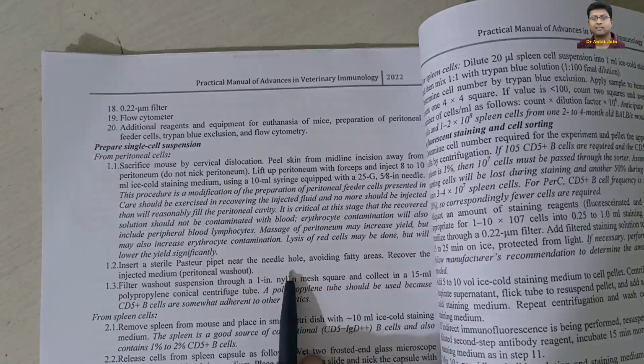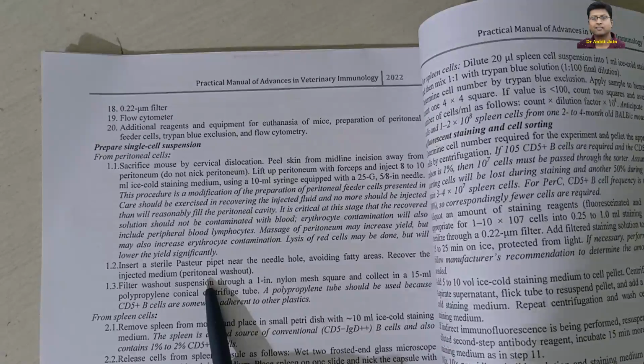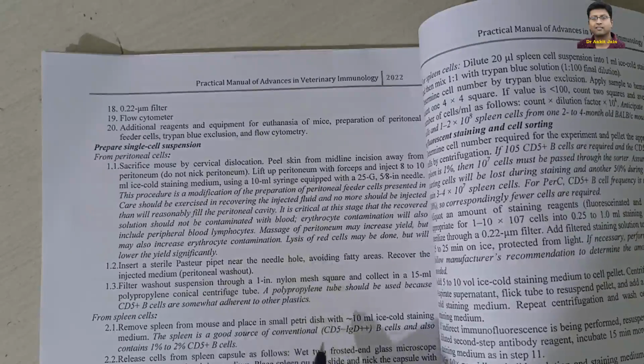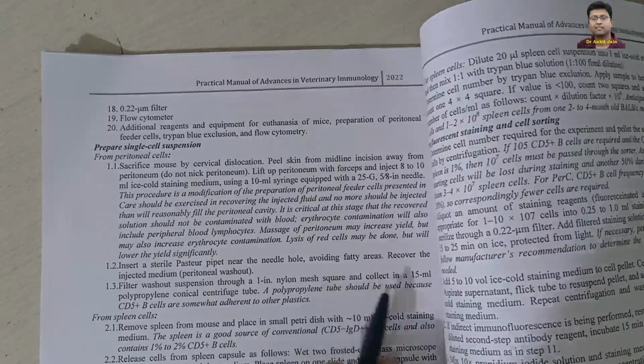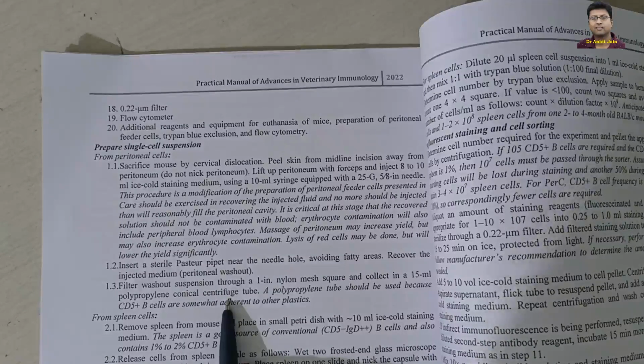So then we have to again pipette this media from the peritoneal cavity, and this suspension is to be filtered with a nylon mesh square and collected in a 15 ml polypropylene conical centrifuge tube.